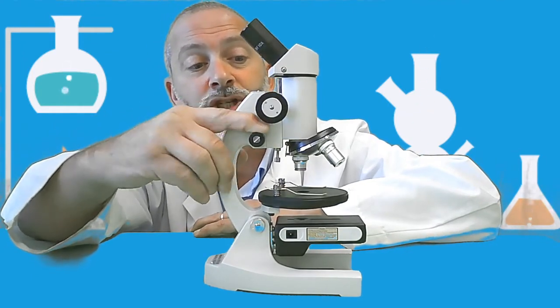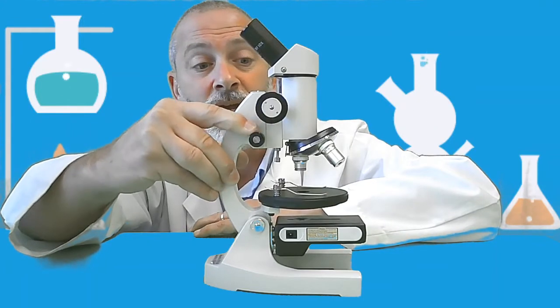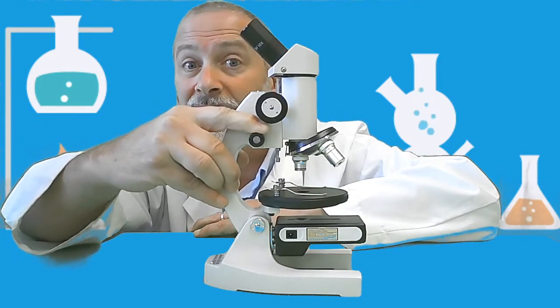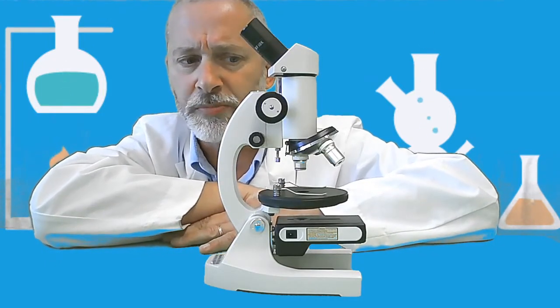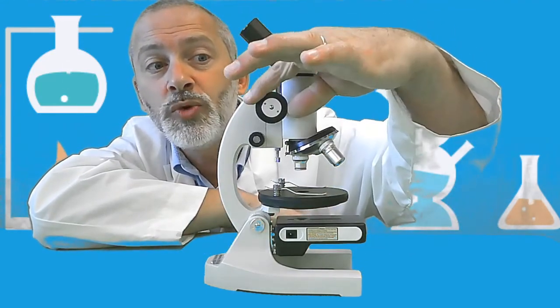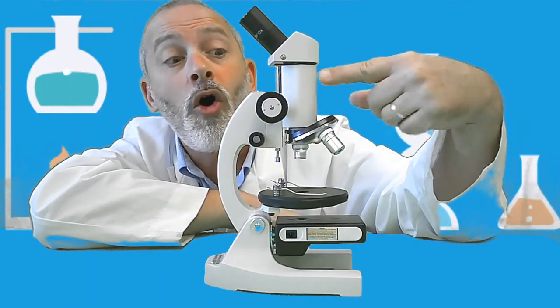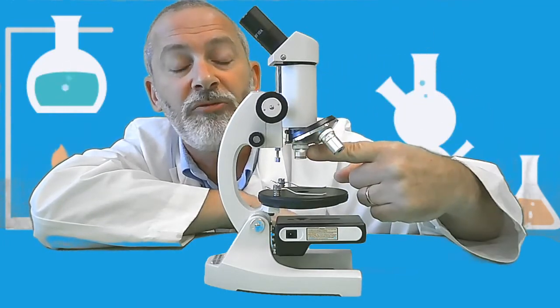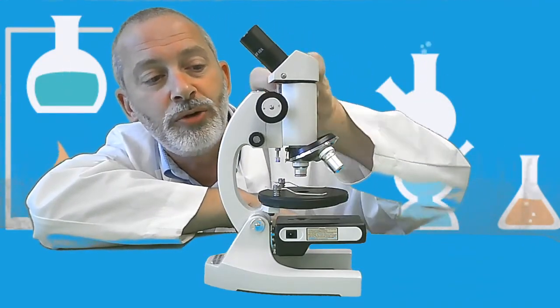And when you move the fine adjustment knob, guess what happens? You can't really see it, but the same thing is happening. You're also making the body tube go up and down, just not that much. You're doing it a lot more with the coarse adjustment knob. So we'll go over this again in the near future, but whenever you begin using a microscope, you always want to adjust the coarse adjustment knob so the body tube is all the way up, and you always begin on the low objective power facing straight down, and then you lower the body tube down.